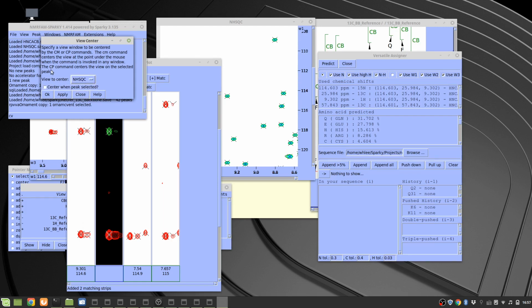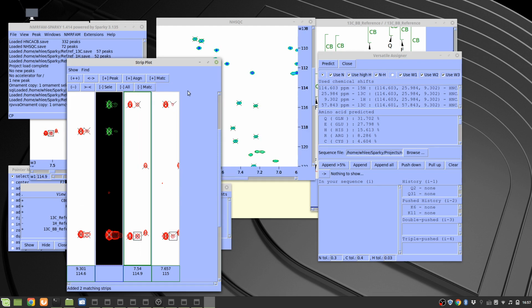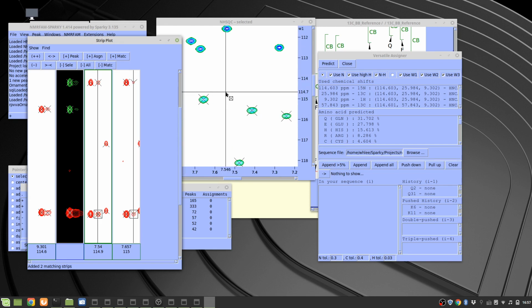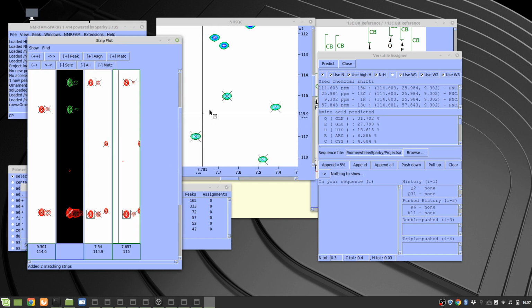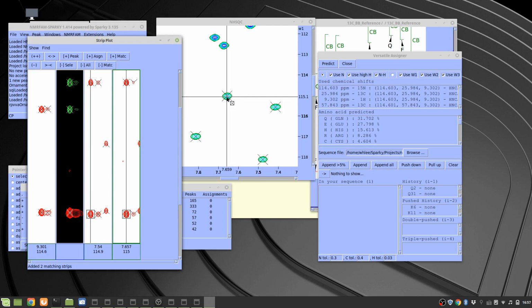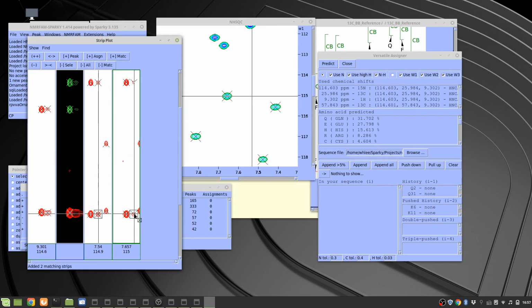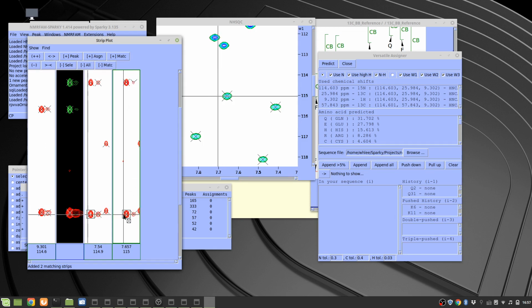Okay, I'm just going to apply, and let's select this one and type capital C, capital P. It's weird, nothing here. What happens if we select this guy? You can see that this one is more robust. That one is like a ridge or satellite or something. So we can just disregard this, right?